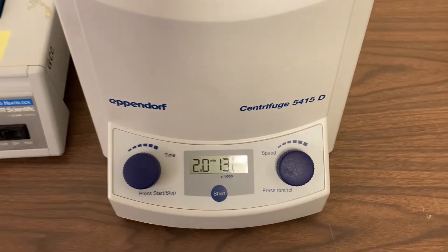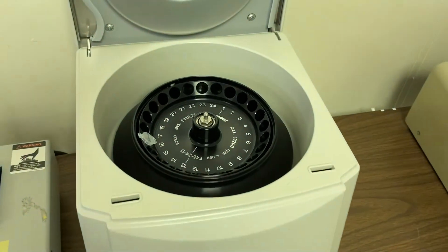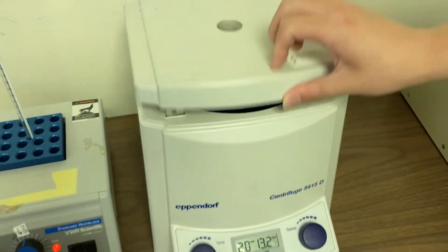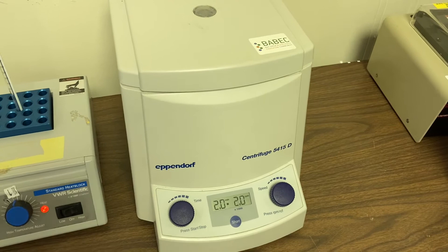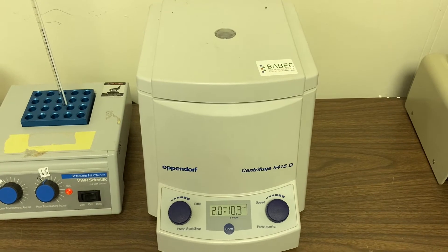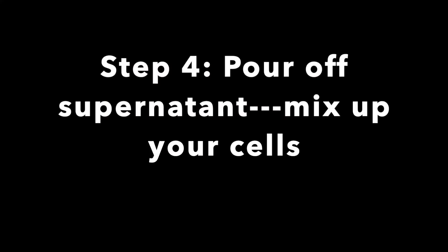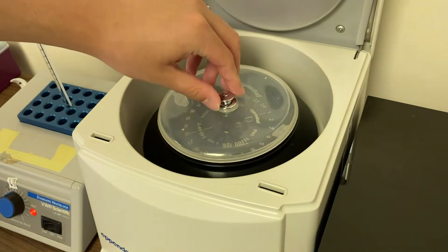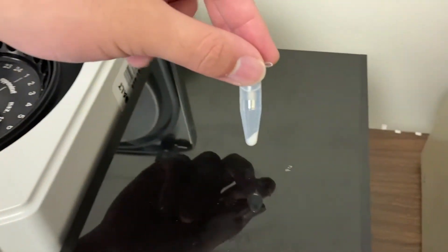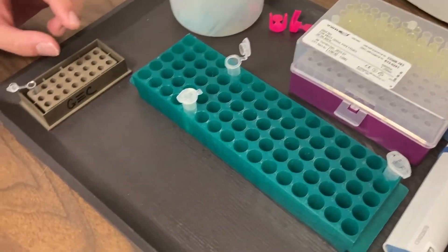In step 3, we'll be using a machine called a centrifuge, set at 2 minutes and spinning at over 13,000 revolutions per minute, or RPM. You set your cheek cells in your microtube on one side and balance it with another microtube on the other side, then start the machine. Once the centrifuge has stopped spinning, remove the lid and take out your cheek cells. You'll see they're in a pellet at the bottom of the tube, packed in tight.